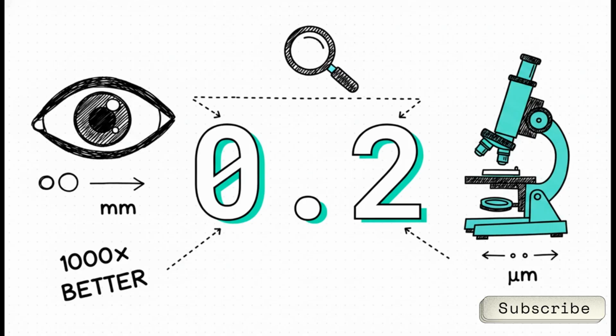Let's talk a little bit more about resolution, because trust me, examiners love to test this. Keep this specific high-yield number in mind, 0.2. The unaided human eye can only resolve objects down to 0.2 millimeters. But a standard light microscope actually resolves all the way down to 0.2 micrometers. That is literally 1,000 times better.